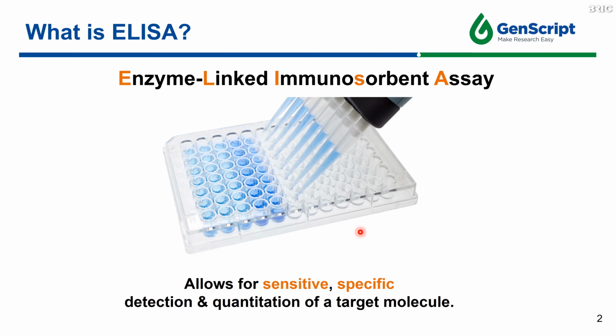The most commonly used enzyme labels are horseradish peroxidase and alkaline phosphatase. Other enzymes have been used as well, such as beta-galactosidase, acetylcholinesterase, and catalase. A large selection of substrates is available commercially for performing ELISA with HRP or AP conjugates. The choice of the substrate depends on the required assay sensitivity and the instrument available for signal detection.